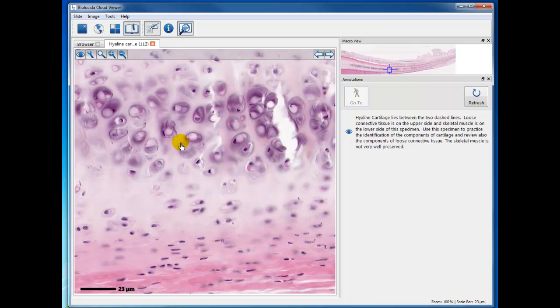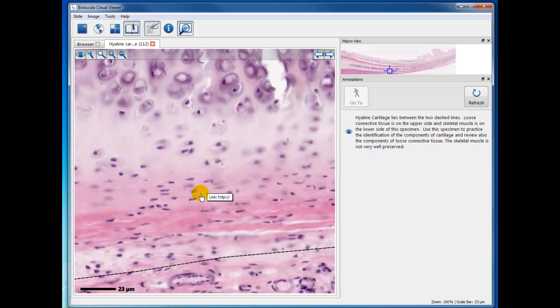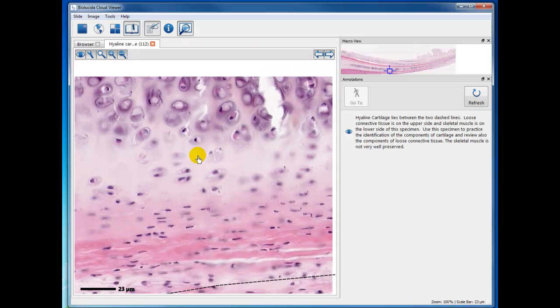So here are chondrocytes that are surrounded by intense basophilic ground substance, and there are names for these areas, and so that's what you're learning in WebMic and in the lecture. So out here we have the perichondrium, and these are chondrogenic cells here, chondroblasts, that as soon as they get surrounded with the ground substance, their name changes to chondrocytes.